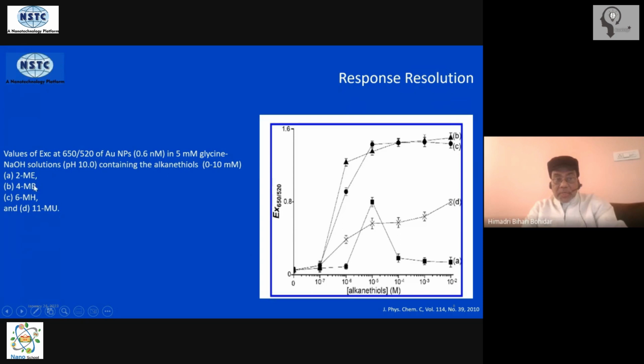For others, 4 and 6, the signal is really very high after a certain concentration, so it makes it detectable. And D is not really an excellent binding partner here, so you don't need to discuss D here. It's intermediate here. So both B and C and A are good binding partners. So within B and C also we should choose only B. There is no need to go to a longer hydrophobic chain. So mercaptobutanol is the candidate, followed by mercaptoethanol. These are the 2 selected ligands that we are going to use.